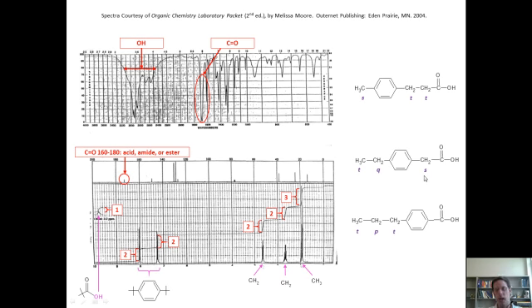to decide which of those is consistent with this NMR spectrum. Now, it might not be absolutely clear what the splitting pattern is here, but I'm telling you that if you were given an example on a standardized exam, they would make it much clearer. It's obvious, however, that none of these hydrogens signals is a singlet. This is obviously something wider than a singlet. This is something way wider than a singlet, and so is this. So any of these examples that have singlets in them, I can automatically eliminate.